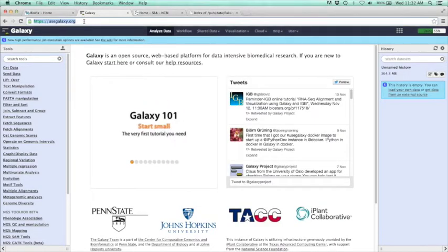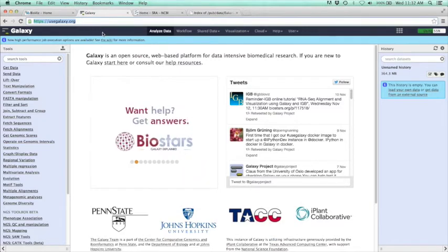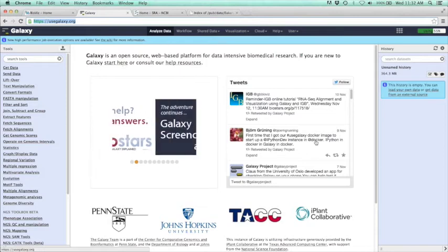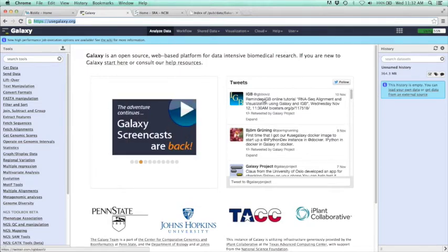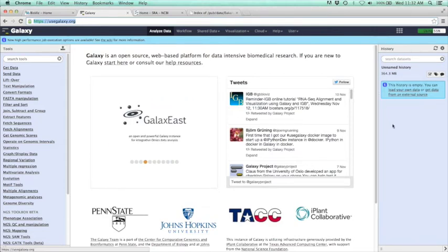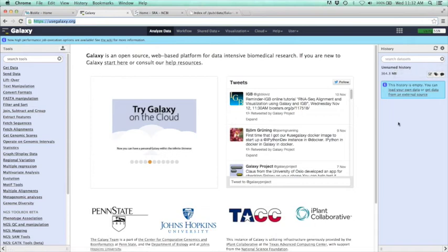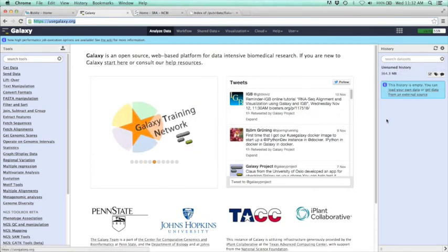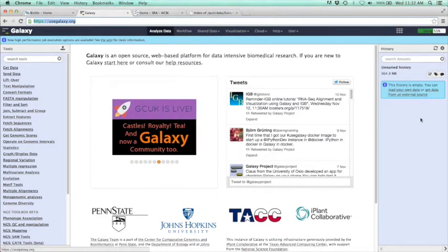This is Galaxy's main page, and it's split into three main panels: the tools panel, the primary panel here which is going to be where we do most of our analyses, and then our history panel. Everything that we do will show up here as a history. From here, we can download whatever datasets we put in or whatever analyses we pull out. We can also change the format and the name of that data.